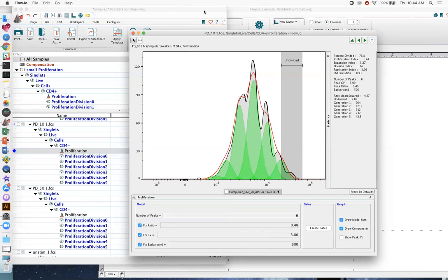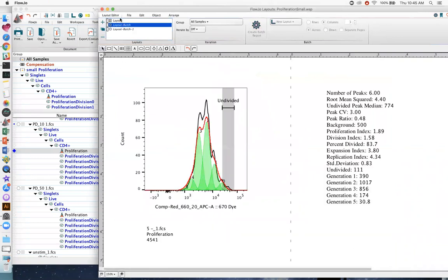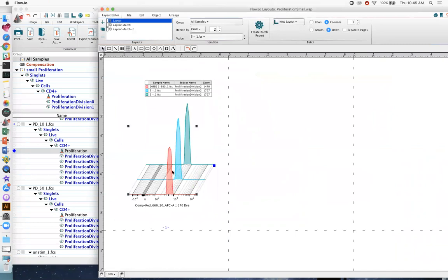We have another set of questions here in the Q&A. So the first question is, can I change the name of the axis, the dye description in the layout? Well, you should be able to. On most other plots, you can. I haven't done this in a while for FlowJo, but let's test this out. Go to your layout, whichever one you're working on. Don't do this with the batched layouts. Do it with the unbatched layout first, because all you have to do at that point, once you change the name, is just click the batch button.